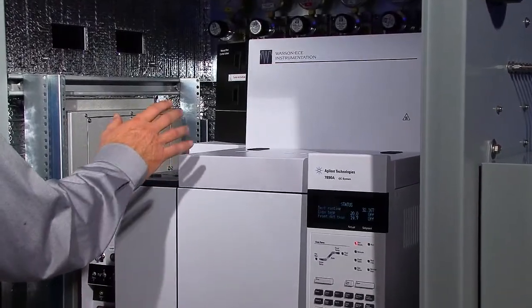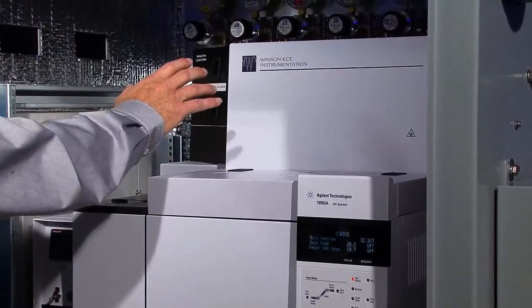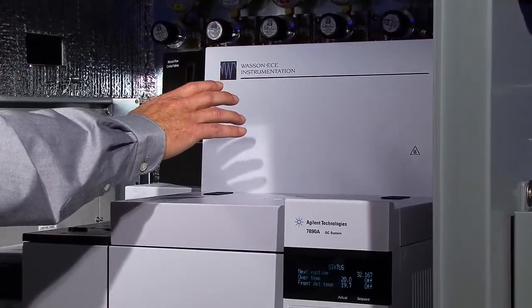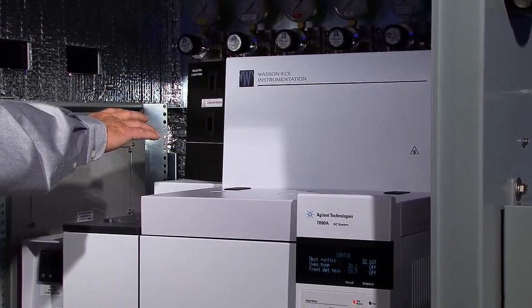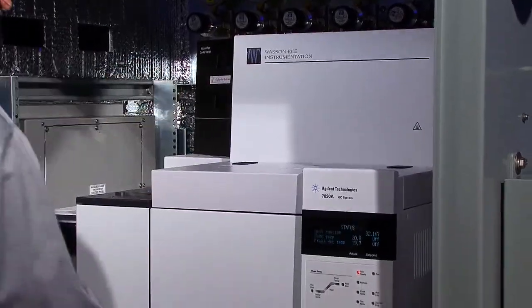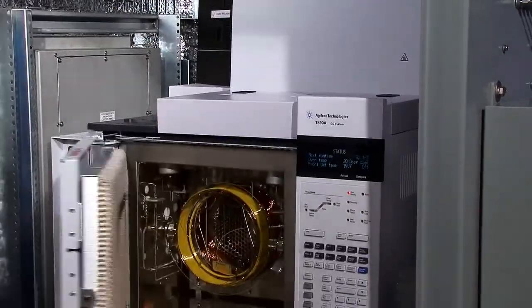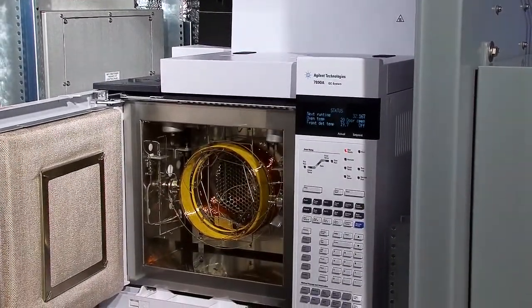Wasson ECE modifies the 7890 concept to include a second isothermal oven for valves and columns. Additional flow capability is housed in a side module. The main oven contains capillary columns and additional valves.